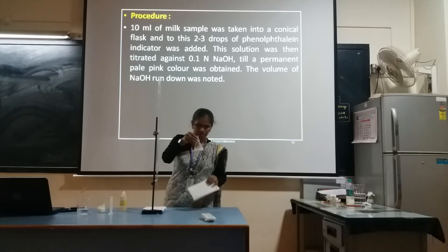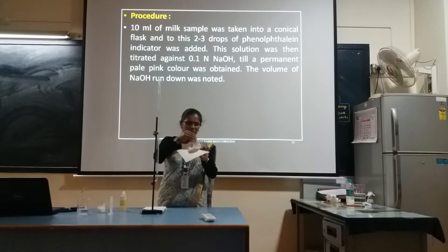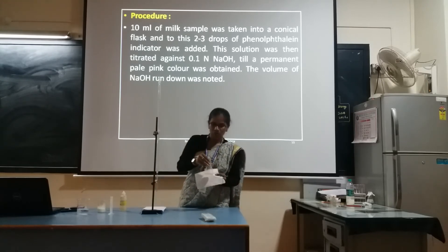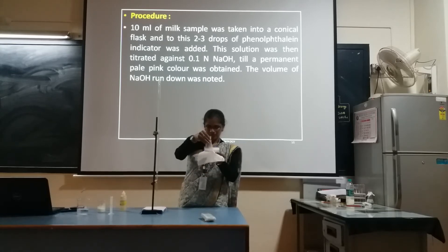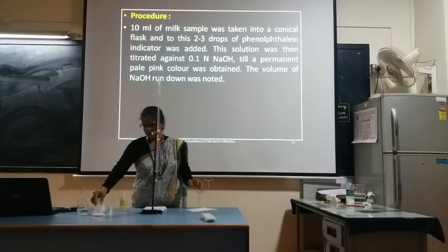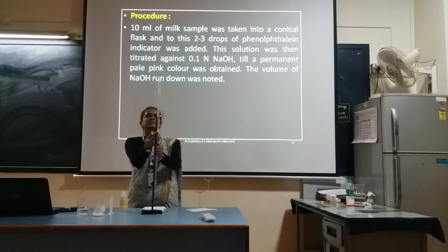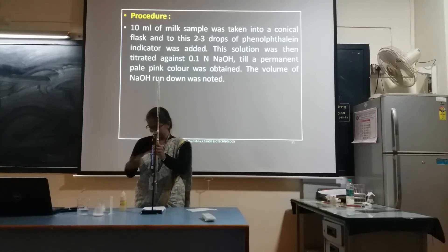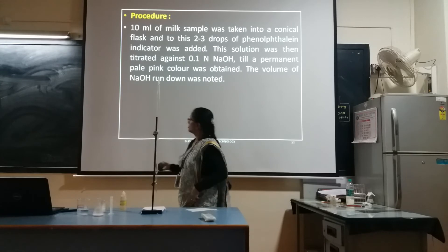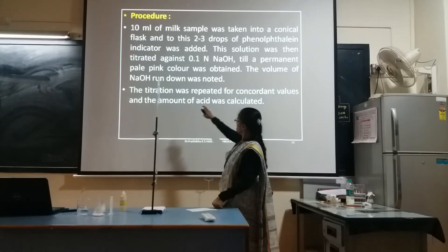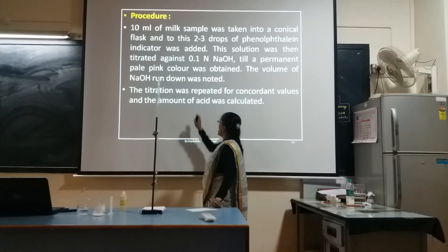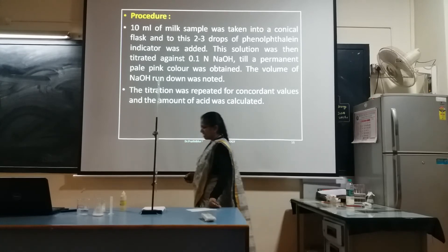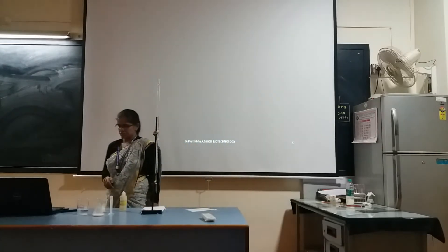Now I am getting the permanent pale pink colour here. Against a white background you can check that it is a permanent pale pink colour. Once you get this permanent pale pink colour, record the result by keeping your eye level straight. The titration was then repeated for concordant values and the amount of acid was calculated using the formula.